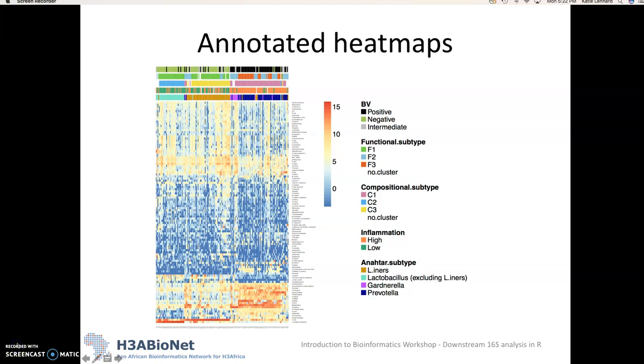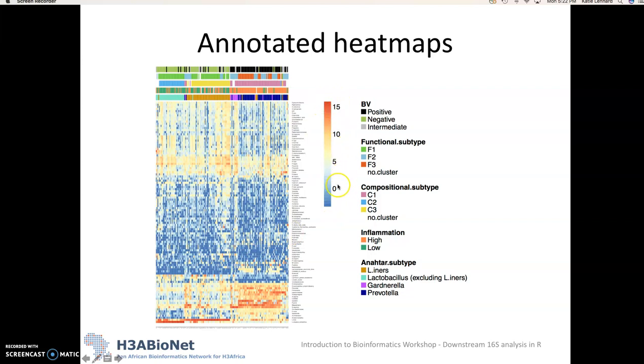So if we look at the different colors in this heat map the red would correspond to taxa that are highly abundant and the blue to taxa that are only present at really low levels or absent at the lowest level. And here we've just log transformed the data to make it easier to visualize on this heat map here.